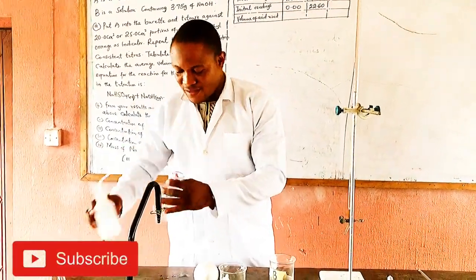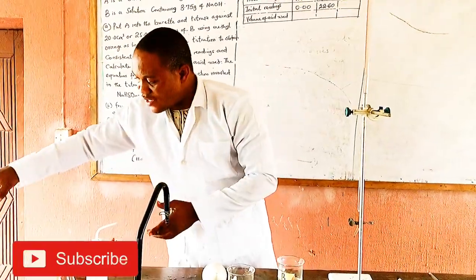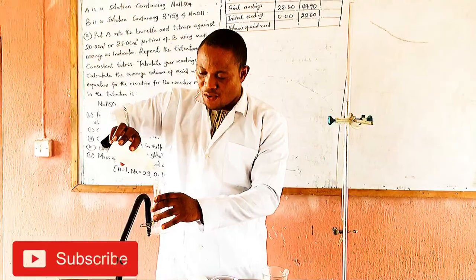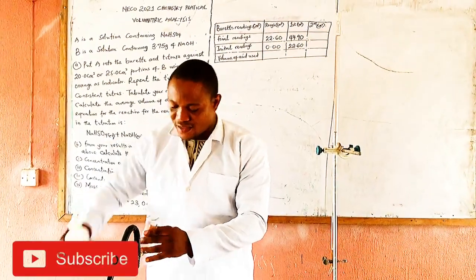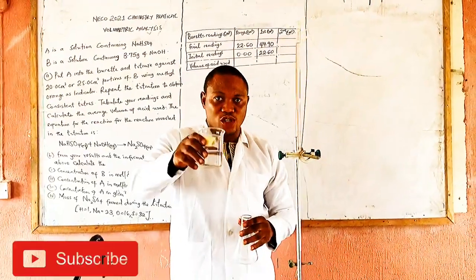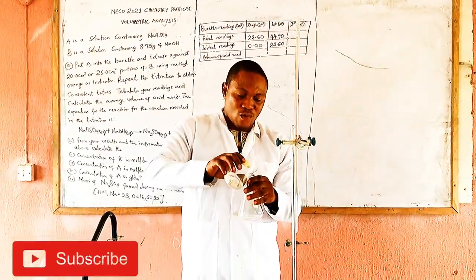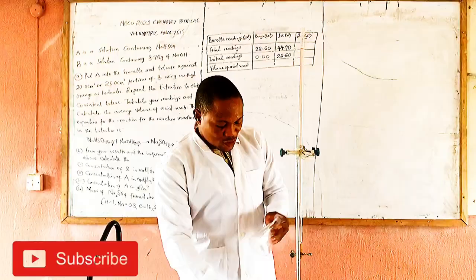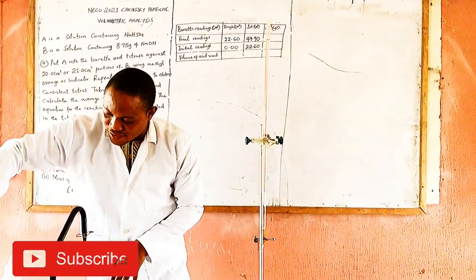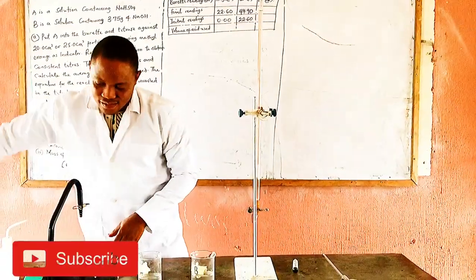I wash with water. After washing with water, don't forget, you are still going to wash with the solution. It is too old for accuracy, okay? So I wash with water already. Don't forget, solution B is to be here. So I will wash with solution B, a little portion of solution B. Very, very important in this place already.